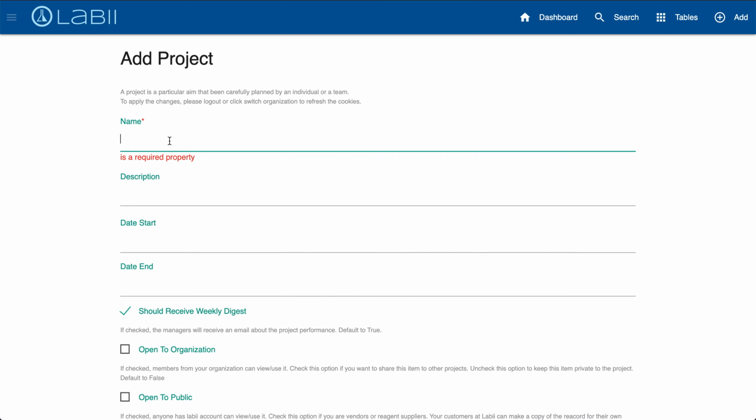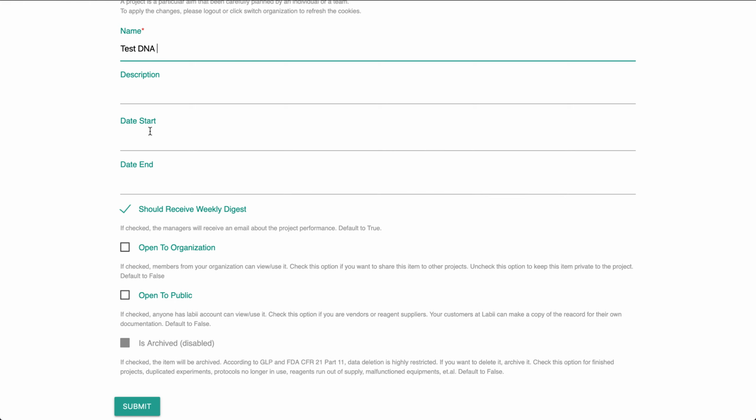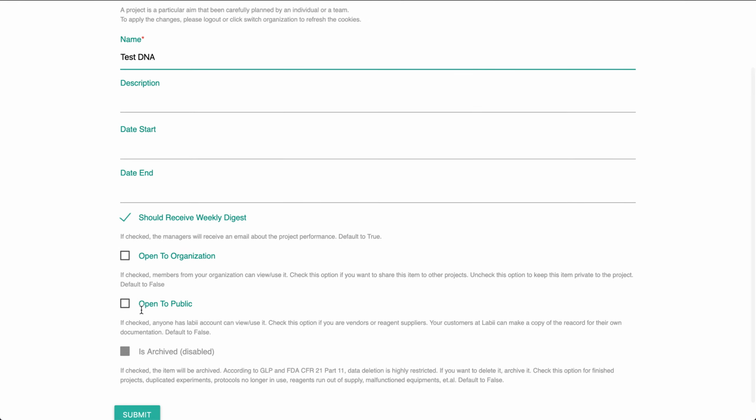So here, just the name, you can just go test DNA. For the name, you can give it a description, start date, and these are all optional fields that we'll cover at the end of the video. And then once you're done, you would hit submit.